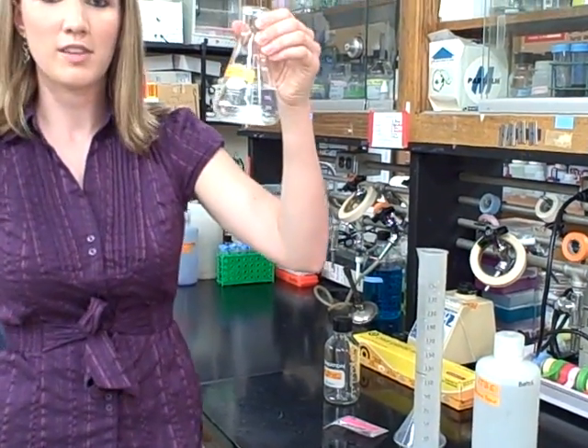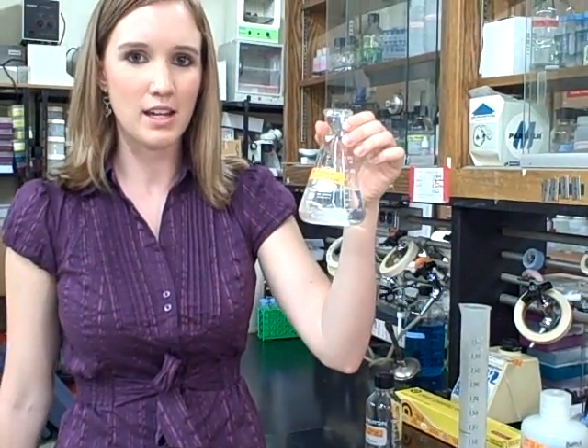I have my 125 milliliters and now we're going to microwave it for a minute and check it.